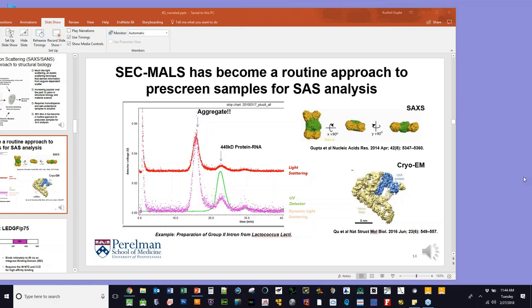Additionally, again, some of that biophysical common sense, if I know I have a protein of a certain size in a Protein Data Bank file, and it has a certain retention time, which would be correlated to its Stokes radius just from using a well-calibrated column with gel filtration standards, and a well-determined diffusion coefficient and hydrodynamic radius from maybe perhaps inline DLS with SEC-MALS analysis. All of these things should be internally consistent.